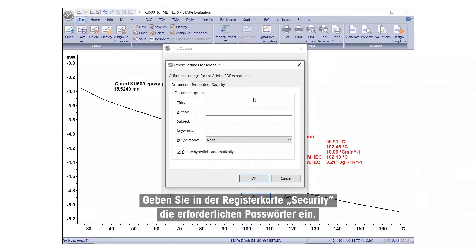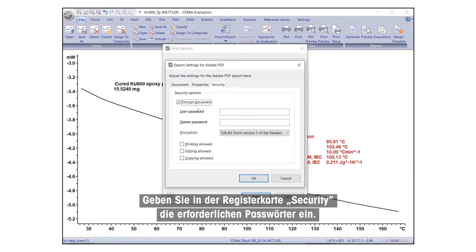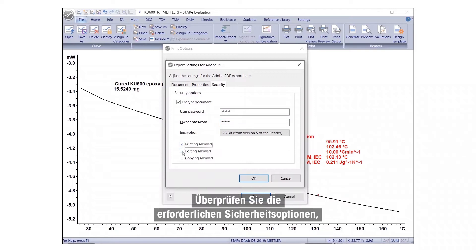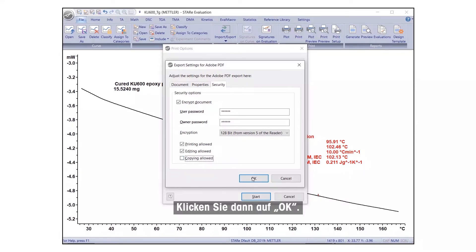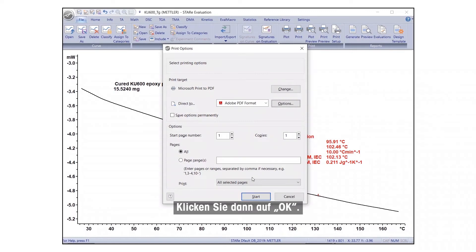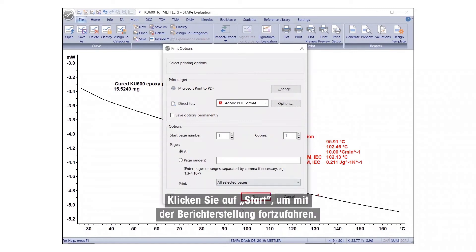Under the Security tab, enter the required passwords. Check the appropriate security options if you would like to permit printing, copying, or editing of the report. Then, click OK. Press Start to continue the report generating procedure.